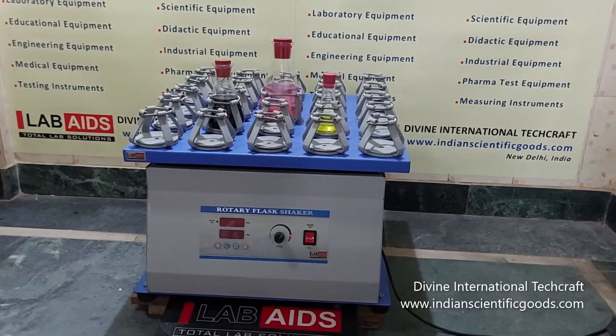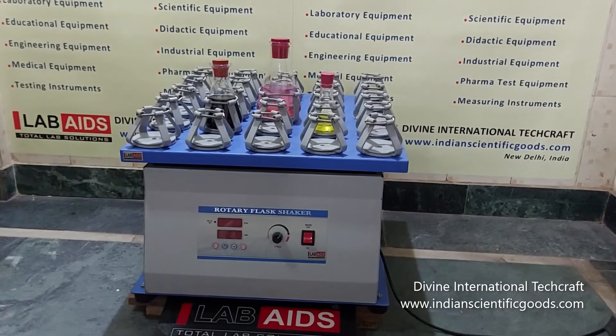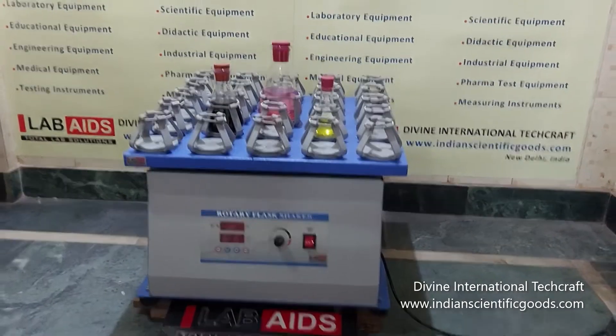Hello, this is a rotary or an orbital flask shaker manufactured by Divine International Techcraft, New Delhi, India.